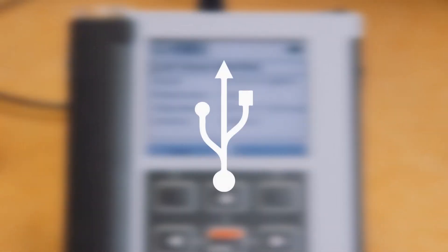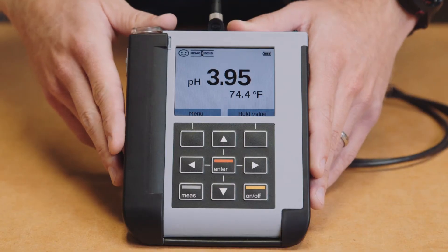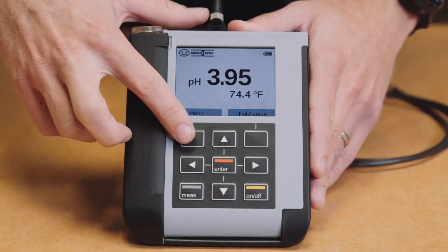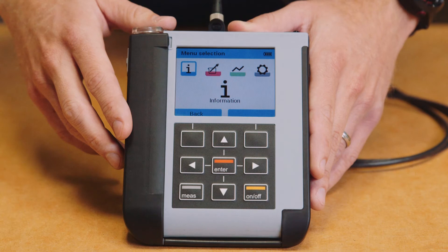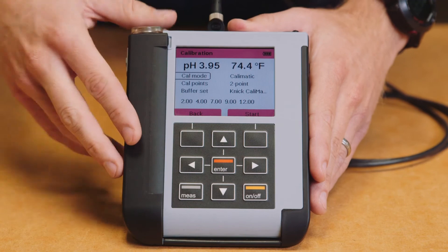MemoSense sensor information can be exported and used for diagnostics. To start the calibration process, press the upper left button to go into the main menu screen on the Portavo, then navigate to the calibration menu and select Enter.